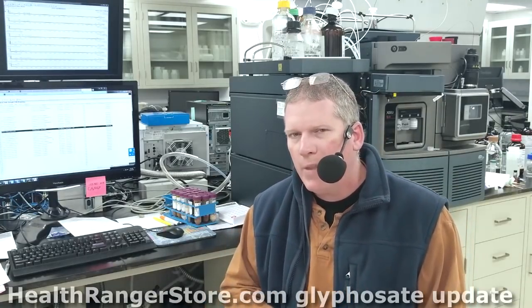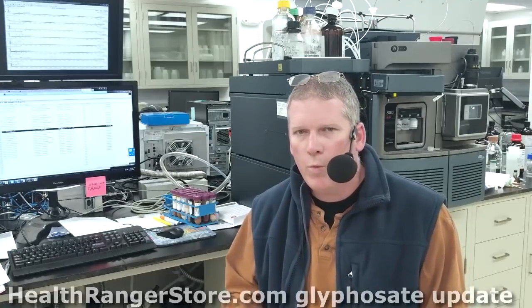However, it doesn't have perfect detection capability. There might be another instrument that comes along 5 or 10 years down the road that will be much more sensitive than this one. And I'm very wary of people who say that they have zero glyphosate in their products, because technically there's no such thing. Why is that? I mean, there's at least one molecule of glyphosate in every product.